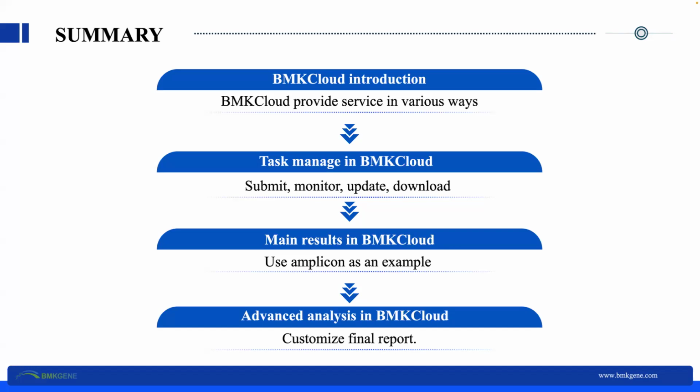The third part we went through about main results in BMKCloud using an Amplicon analysis report as an example. We went through all this part of the main results. And the last part, we talked about advanced analysis in BMKCloud, how to customize final report in BMKCloud.